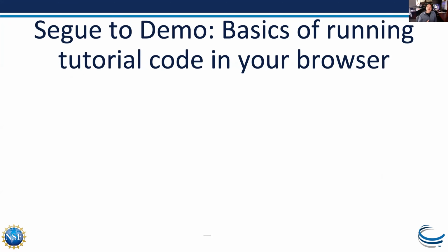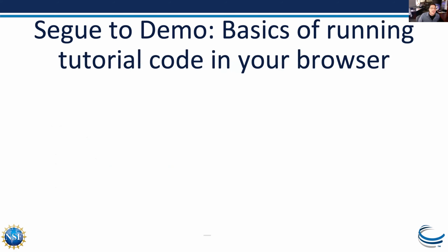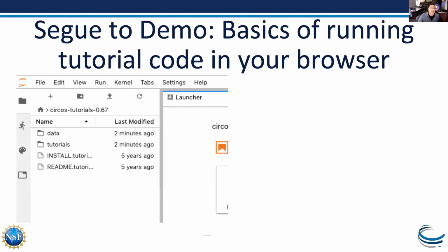But to understand how the demo is working and how you can go beyond that, I want to show you what is there. If you go to the Circos site, there's this whole tutorial system with different sections, and each one has a different page that illustrates one aspect. In fact, this goes way down. There are about 10 sections. I'm not showing all of this. This is just the top of the page, and it's actually an edited version of that.